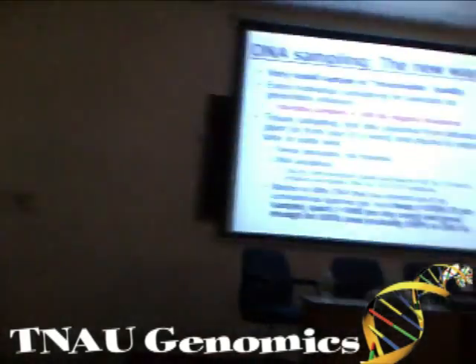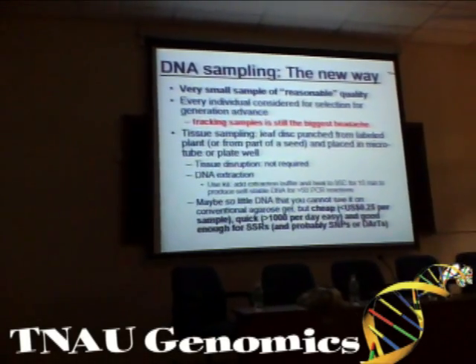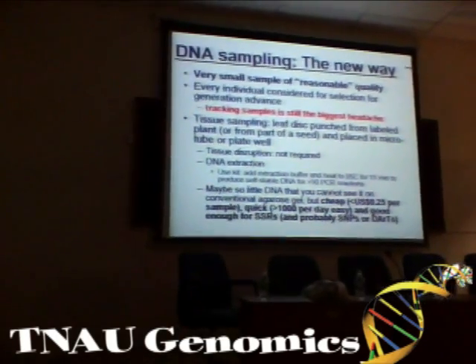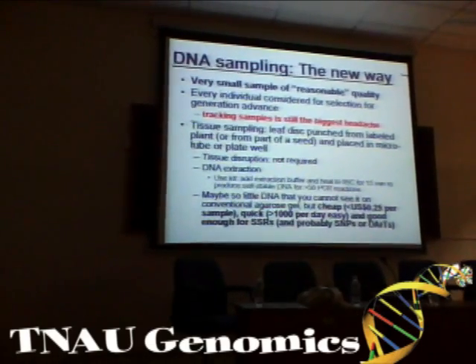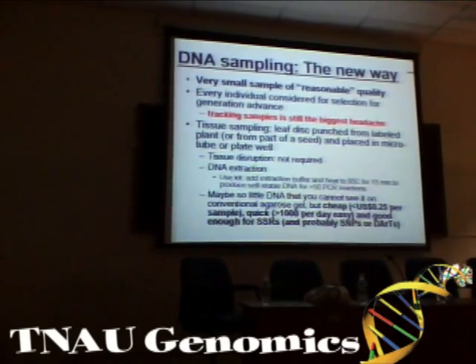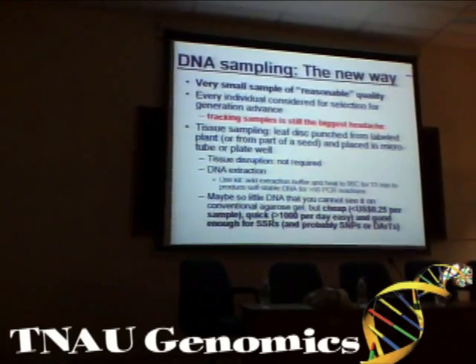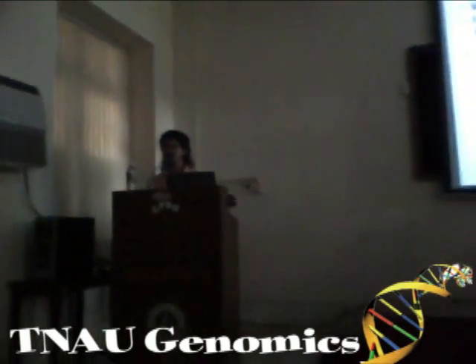There are now buffer solutions for DNA extraction that are available in the market, where your DNA extraction tools are a plastic micropipette tube, a paper punch, a hot water bath, and a Sharpie, indelible ink pen to write the sample number on the plant, write the sample number on the tube, and then throw it in the hot water bath with the buffer at the top.